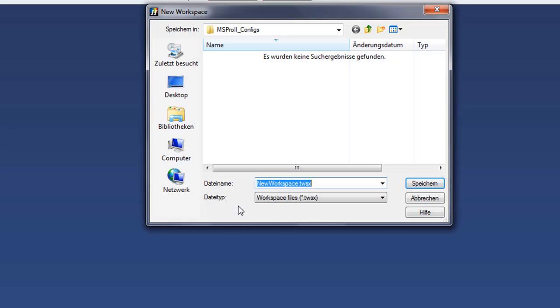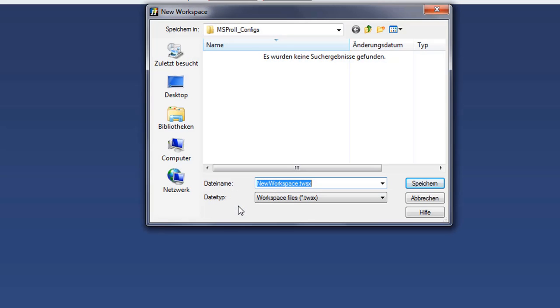To create a new workspace, click on the button. You can enter a filename. I decide for multi-channel MMS as I have a 5-channel configuration.